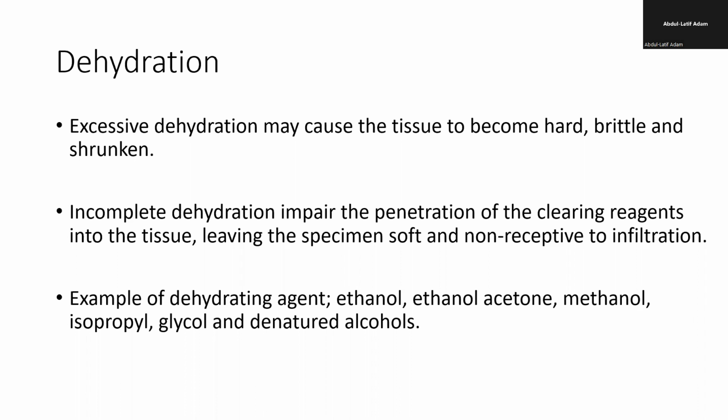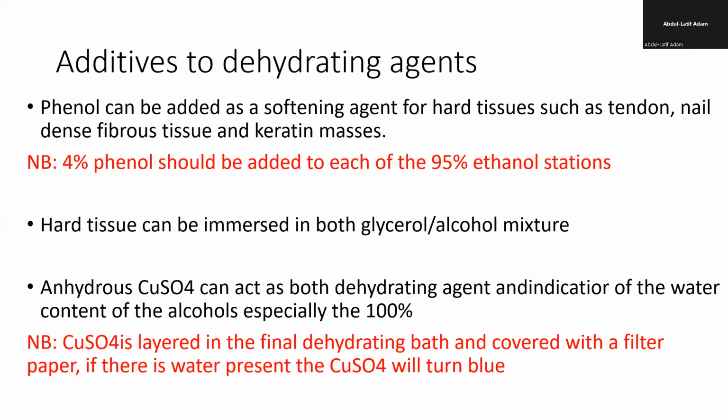So that water will not be removed, and then it will stay in the tissue and cause more damage to the tissue. Okay, so there are several dehydrating agents, as I mentioned to you. They are basically alcohol. So you have all the alcohols, depends on what is available to you. You can have ethanol, or ethanol acetone, you can have methanol, isopropanol, butanol, whatever alcohol that you get, you can use it as a dehydrating agent.